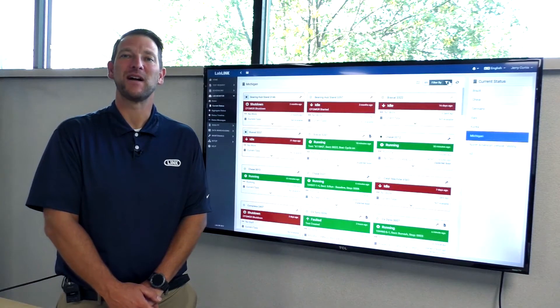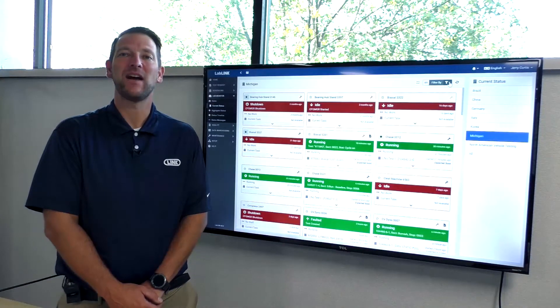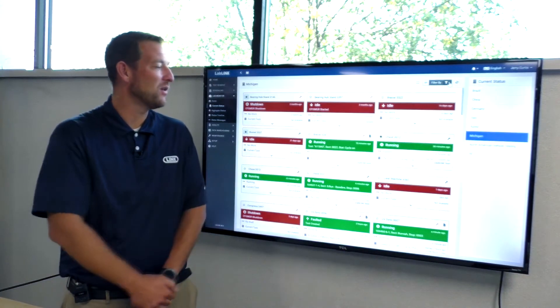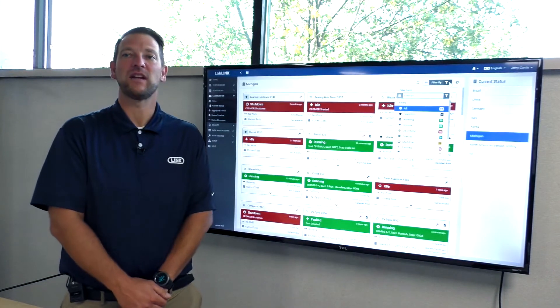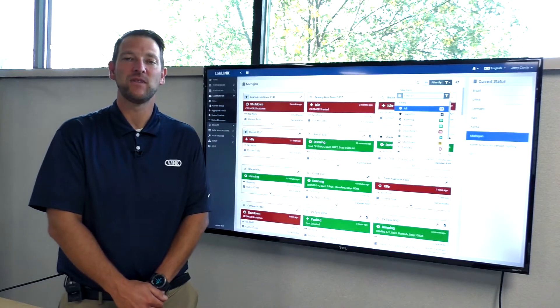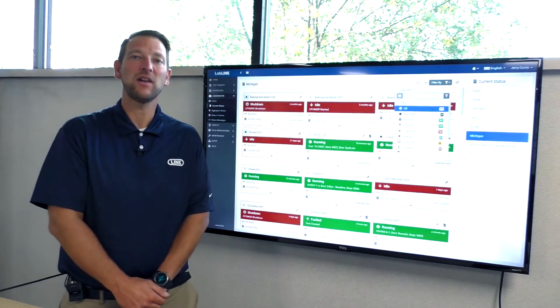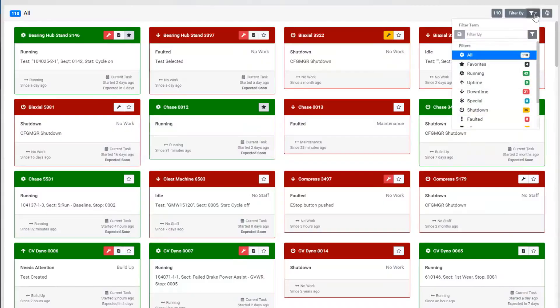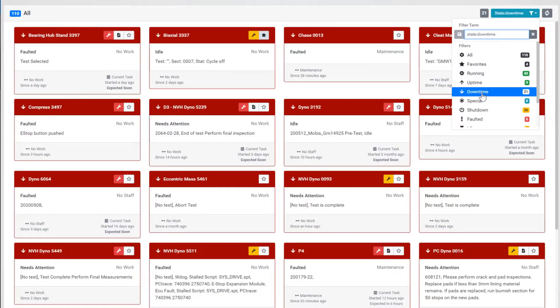The lab monitor module provides an at-a-glance view of all of your connected equipment, showing how the lab is performing, what machines might be requiring attention, and if a machine is down or experiencing a fault during its testing.